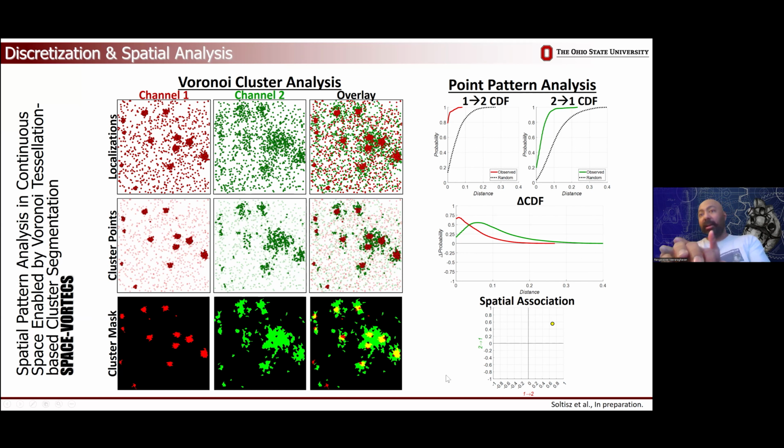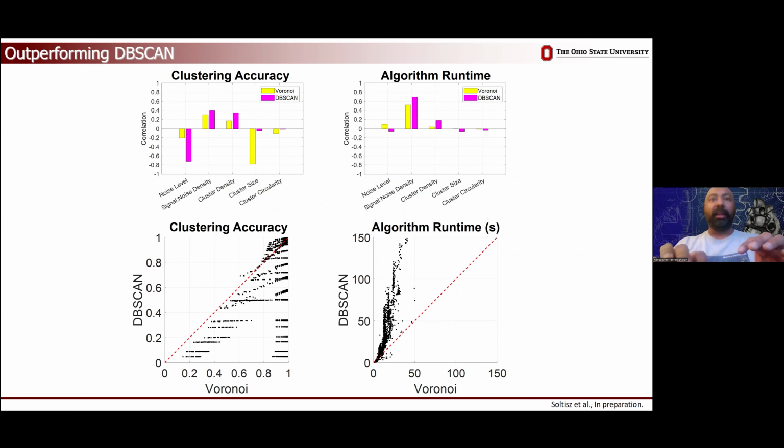So, another point here is when we're measuring these attraction-repulsion relationships, that parameter is bounded between -1 for perfect repulsion, 0 for indifference, +1 for perfect attraction, which means any system that you analyze using this, the results are going to stay within a -1 to 1 Cartesian coordinate system, which is a very easy thing for anybody from any discipline to understand. It's a very easy quantitative way to track complicated changes.